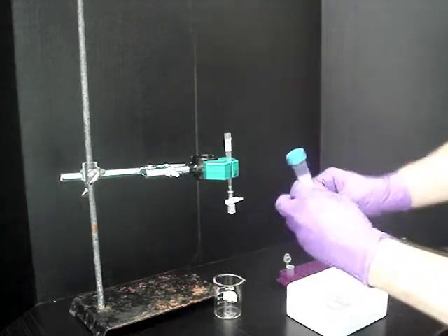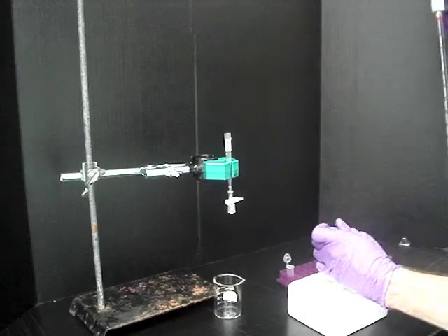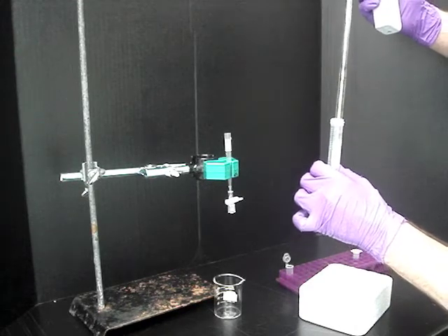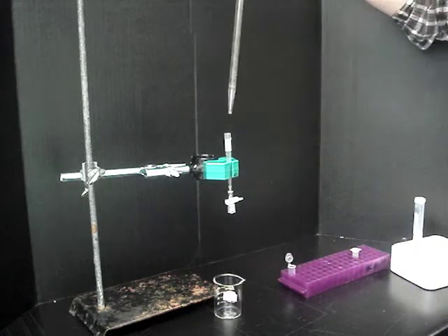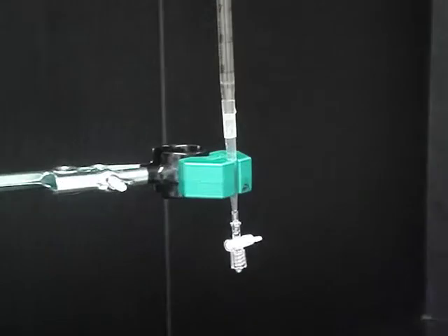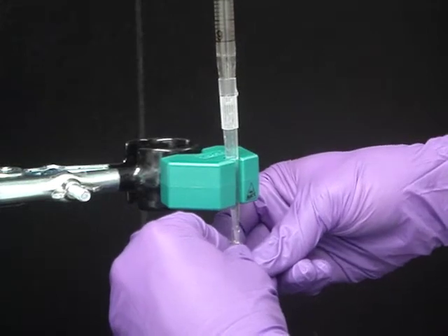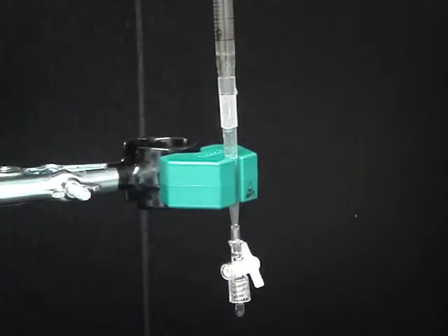Once we've diluted the bead nuclei mixture, we draw it up into a 10 ml serological pipette and allow it to flow past a magnet to collect the bead-bound nuclei. We do this by inserting the serological pipette into this homemade magnetic purification device, which consists of a magnet with a 1 ml pipette running through the slot in it. We allow this solution to drain at a slow flow rate, and as it drains, the bead-bound nuclei and free beads will stick to the wall of the pipette tip.